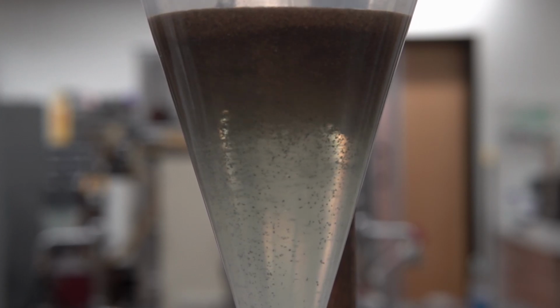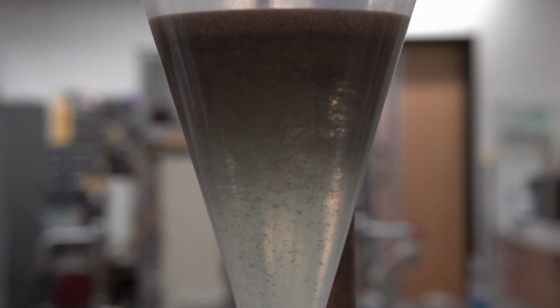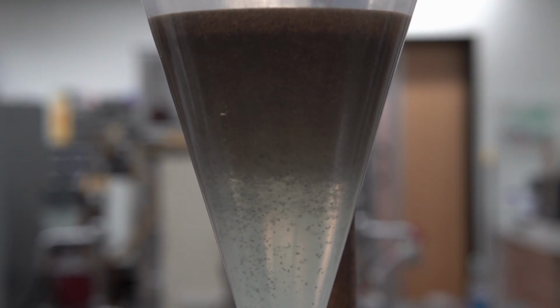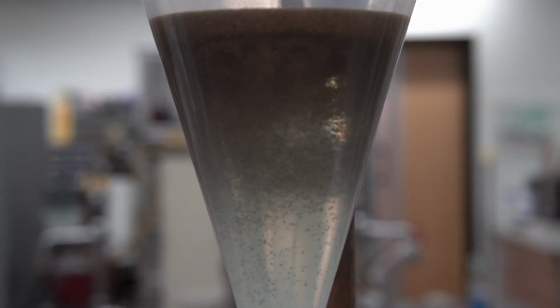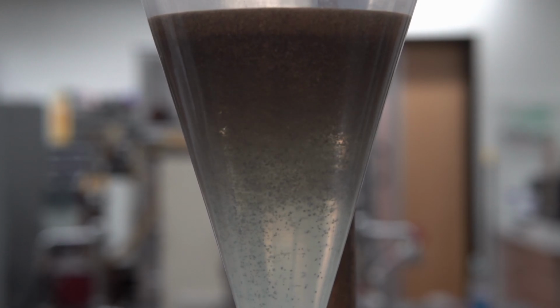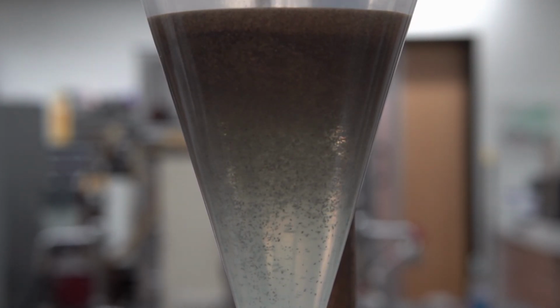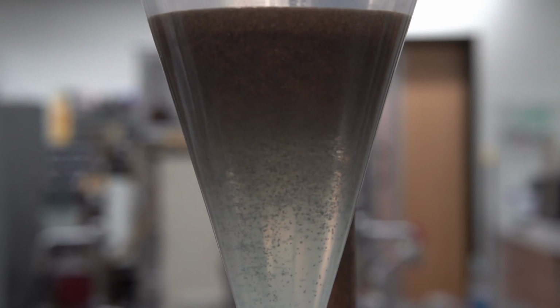So what's going on here is I'm separating 2 different minerals. One of them is lighter and one of them is heavier. One of them has a specific gravity less than 2.9, and that mineral will float, and the mineral that has a specific gravity of greater than 2.9 will sink to the bottom, and we'll have our mineral separation.